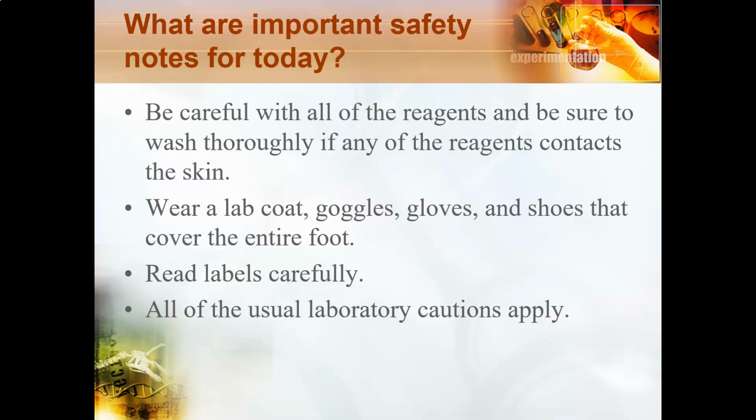Important safety notes for today: be careful with all of the reagents. Make sure you wash thoroughly if any of the reagents contact your skin. Of course, you'll wear a lab coat, goggles, gloves, and shoes that cover the entire foot. The buffer we use here is very, very basic, and you wouldn't want to get that on any part of exposed skin. Make sure you read the labels carefully, and all of the usual laboratory cautions apply.